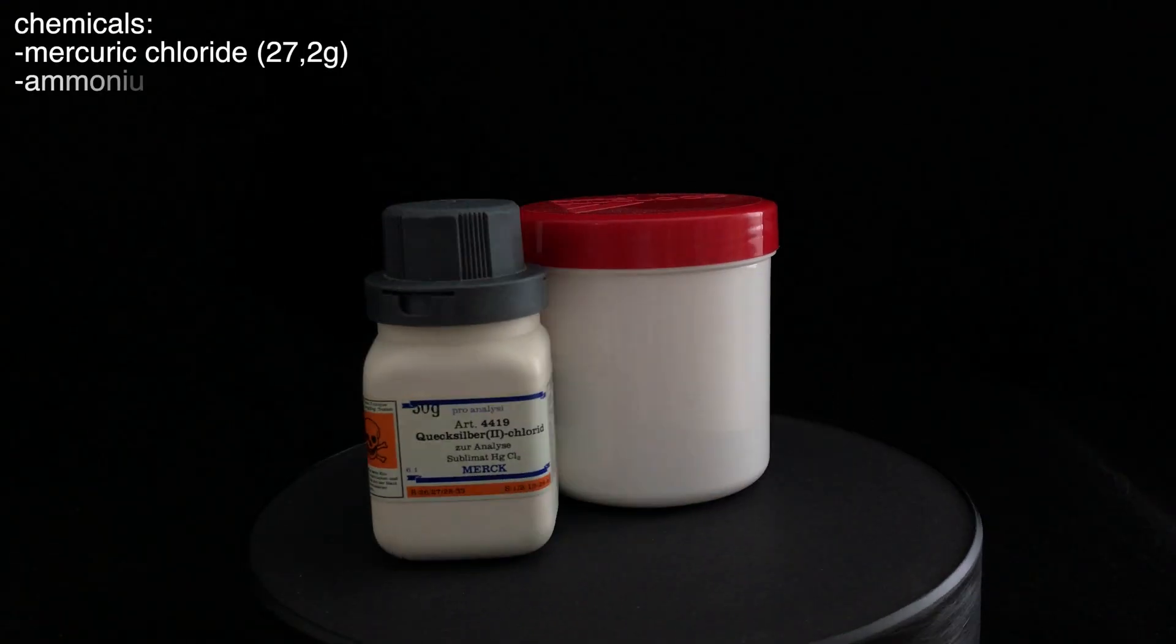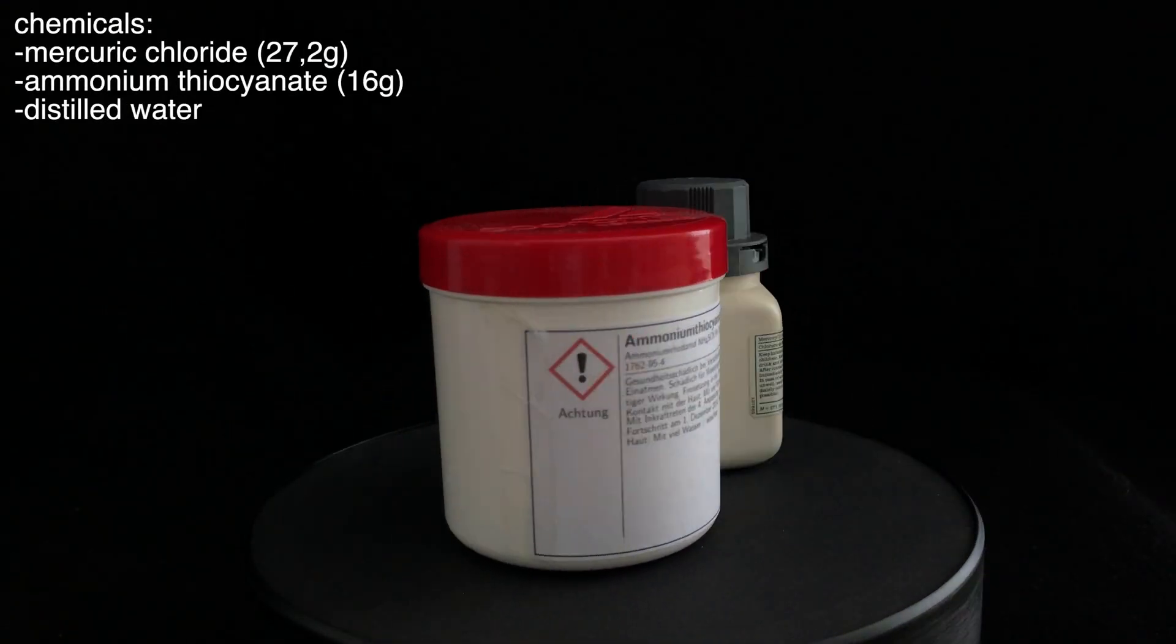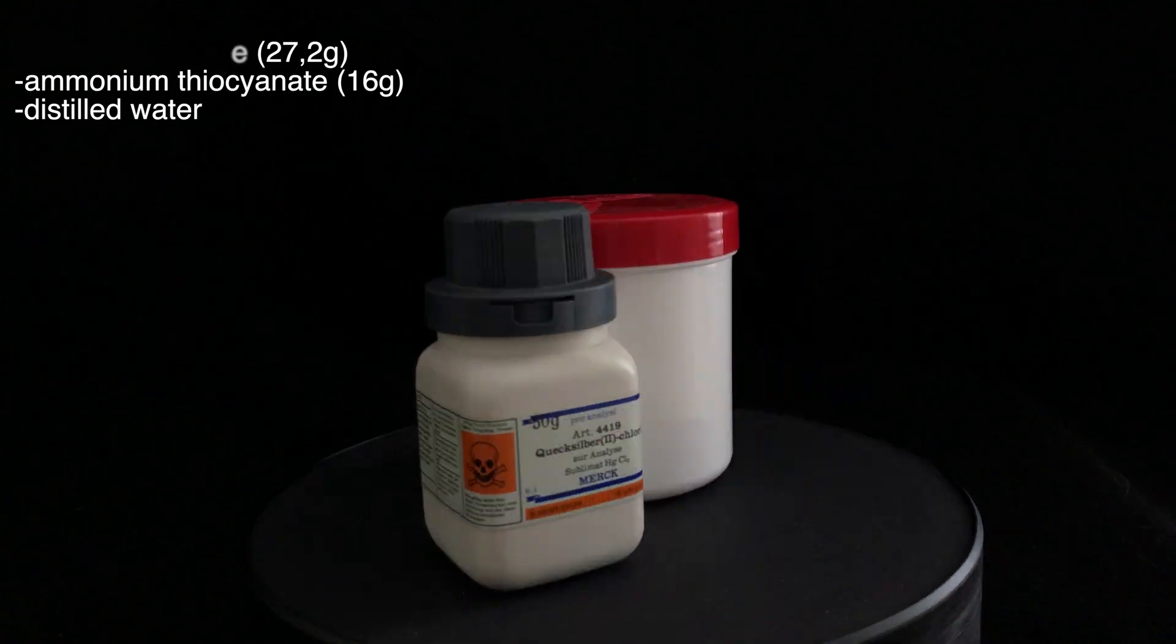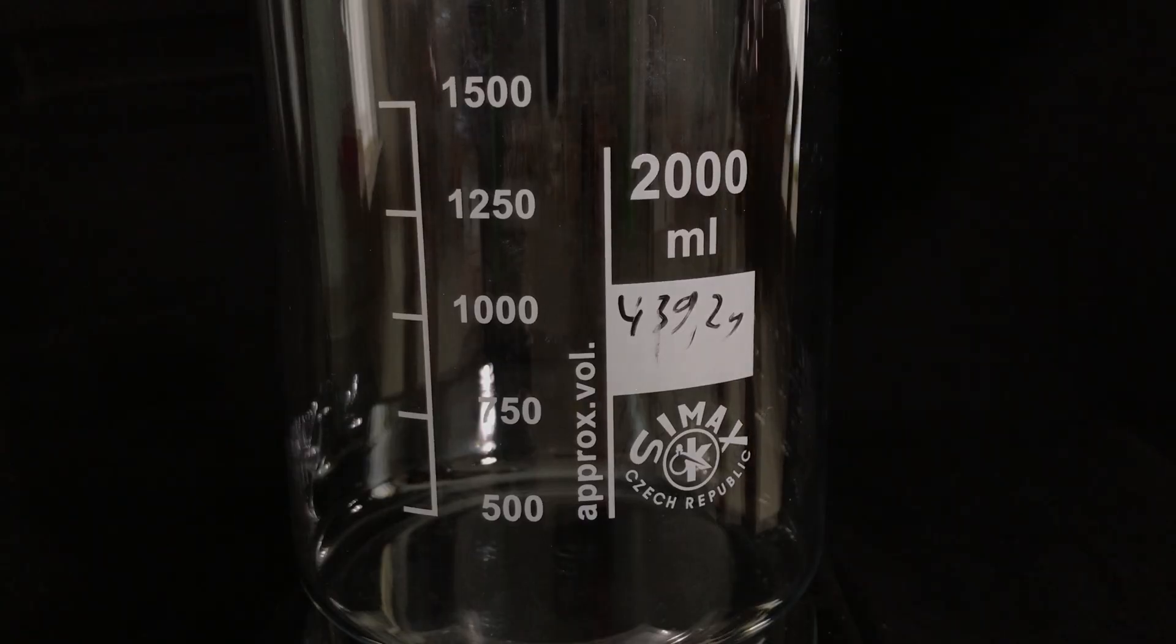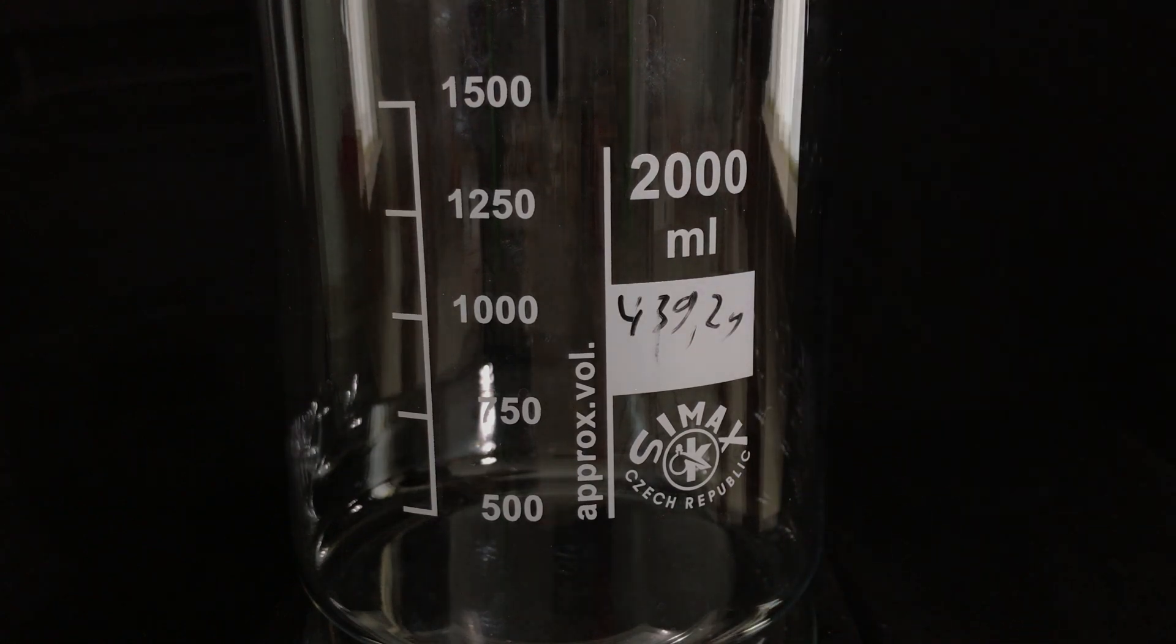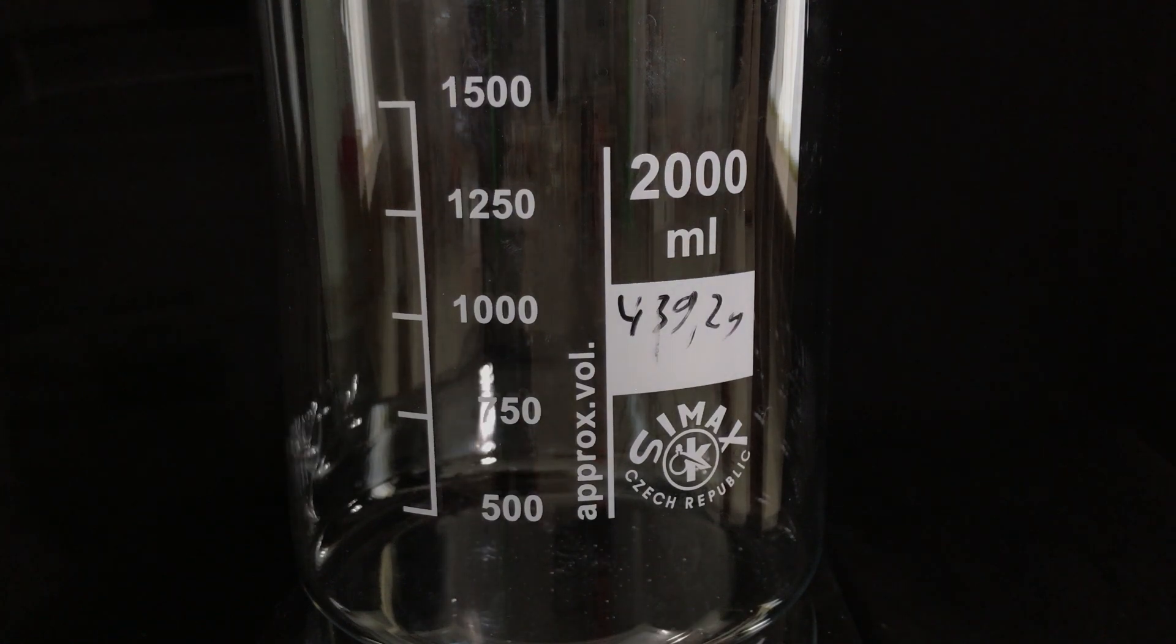The chemicals needed for this are quite simple. 27.2 grams of highly toxic mercuric chloride and 16 grams of ammonium thiocyanate. We then started off by adding the mercuric chloride to the beaker. We made sure to go as slow as possible because spilling any mercuric chloride would be a disaster.